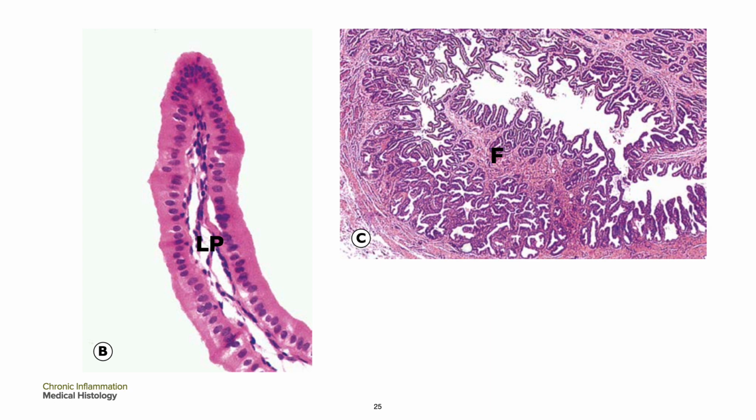Numerous short, irregular microvilli account for the unevenness of the luminal surface. The lining cells concentrate bile 5 to 10-fold by an active process. The resulting water will pass to the lymphatics in the lamina propria in letter LP.